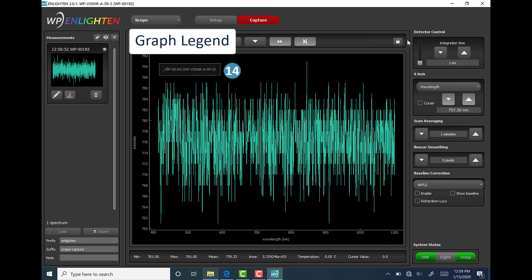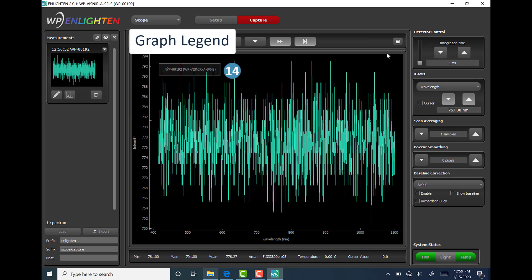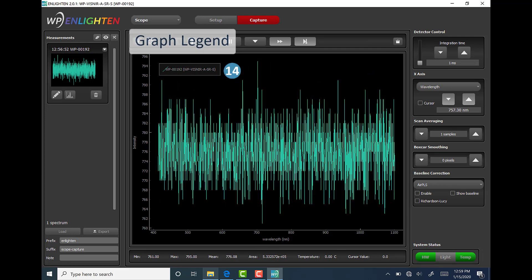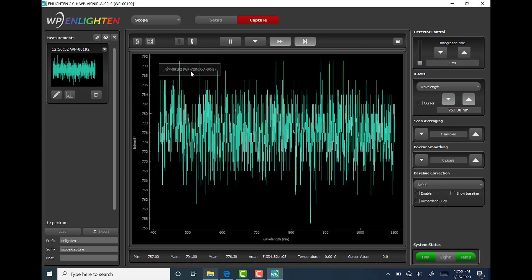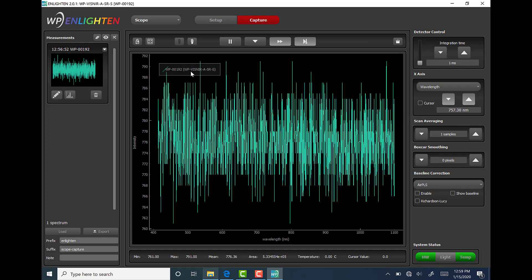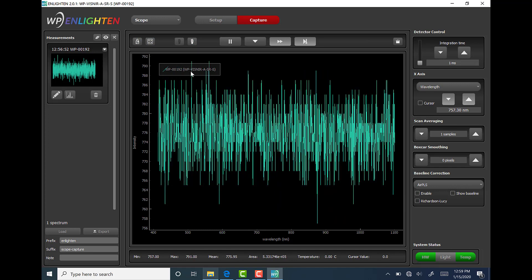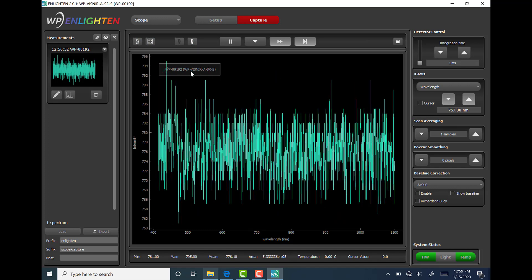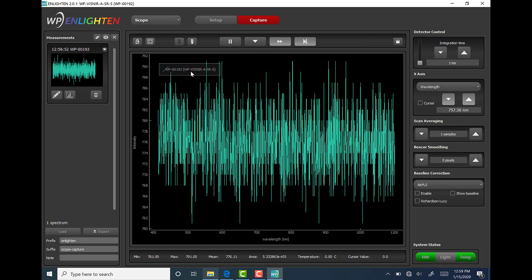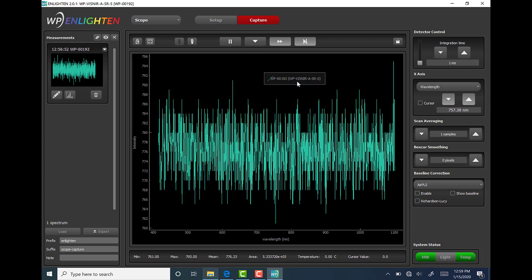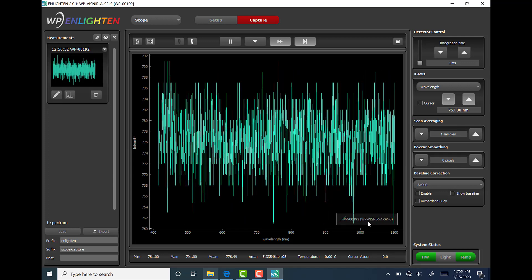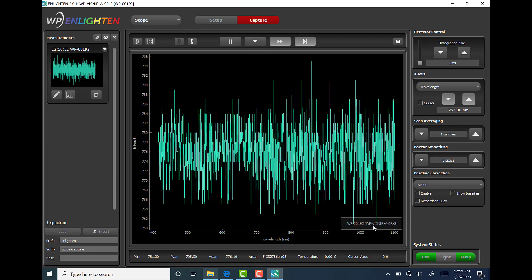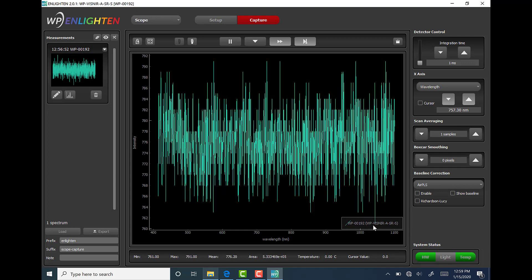Lastly, we find the graph legend in the upper left corner inside the spectrum chart by default. The legend, however, can be moved to anywhere within the chart by simply clicking and dragging it as desired. This feature identifies each individual measurement in the spectrum chart.